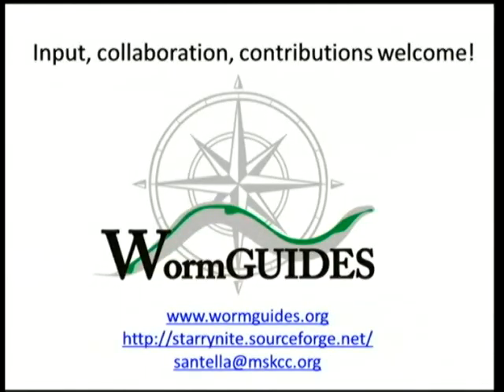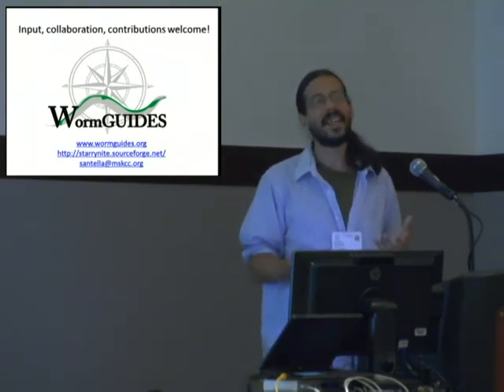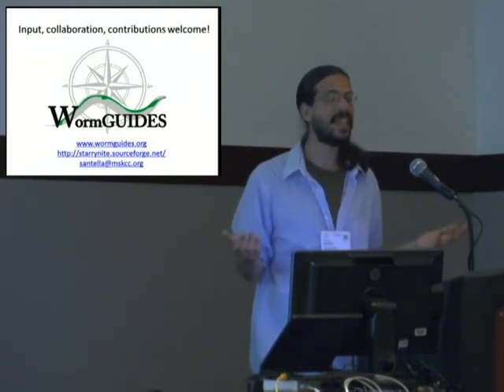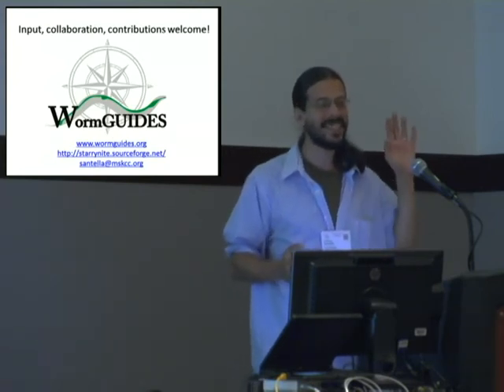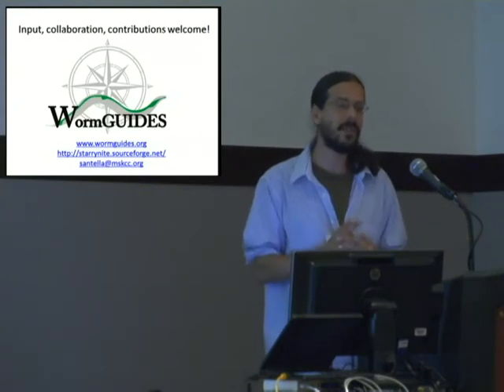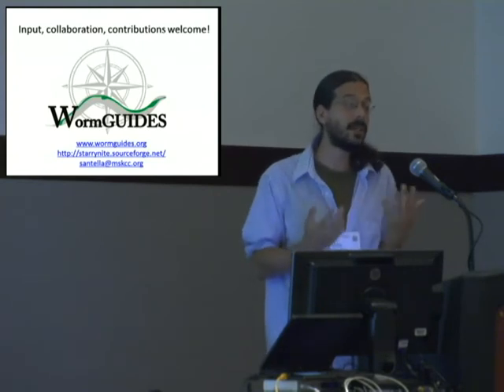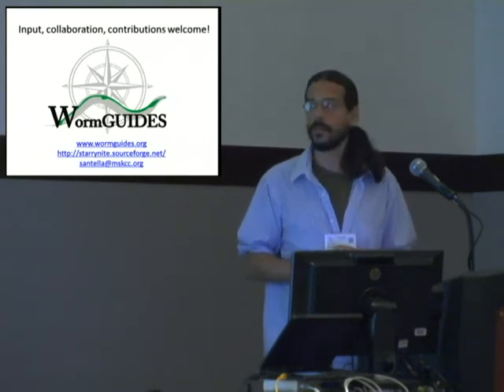With that, I'd like to say that we really welcome, at this stage, input or collaborations. I think probably everyone here knows that, like most open source academic projects, it's open source in the sense that you can easily download the source code and compile it should you want to, but I can probably count without taking my shoes off how many people have actually done that. Most users use it at the application level, but we are really interested in trying to figure out, because we certainly don't know how, to make it a real, more community-based open source project. Thanks.